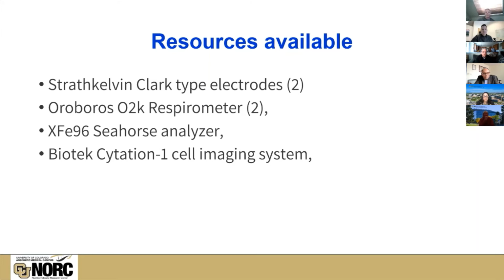Every one of these pieces of equipment has pros and cons. Not one is any better than the other. They're complementary. So if you can't get something done on one system, you can move to the second system and hopefully get it done.